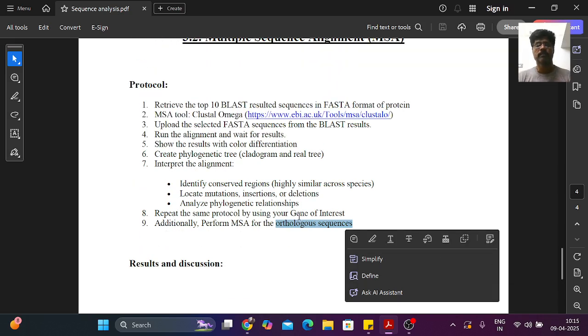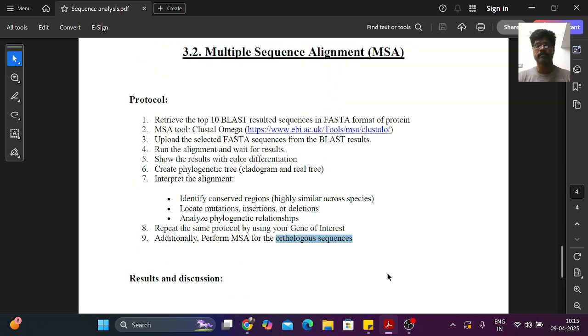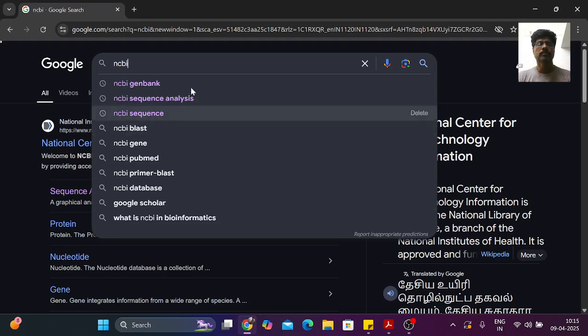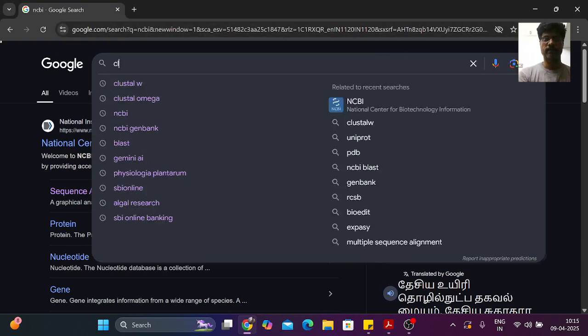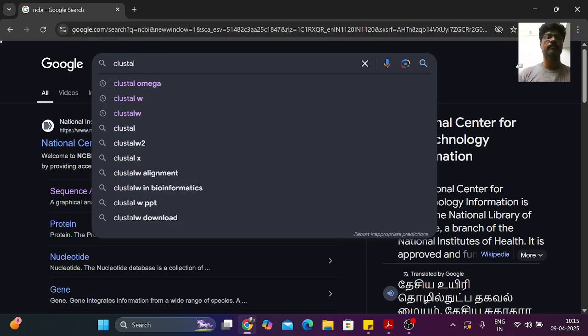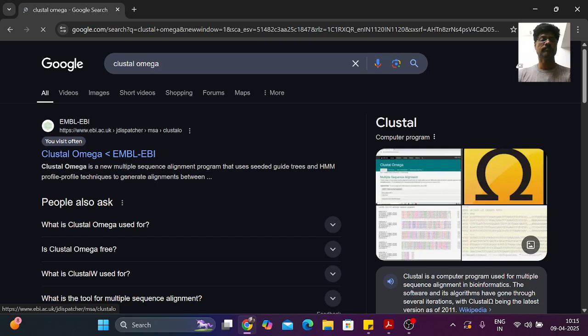Okay, shall we go to the practical session? Just go to Google and type Clustal Omega, and I will go here.